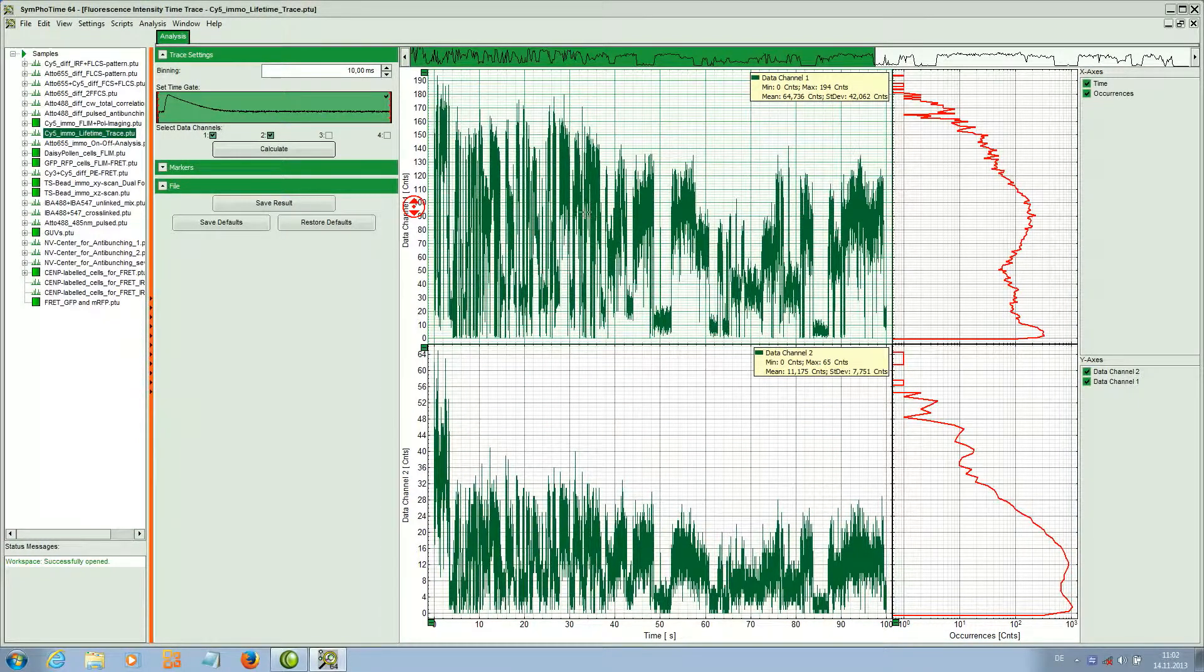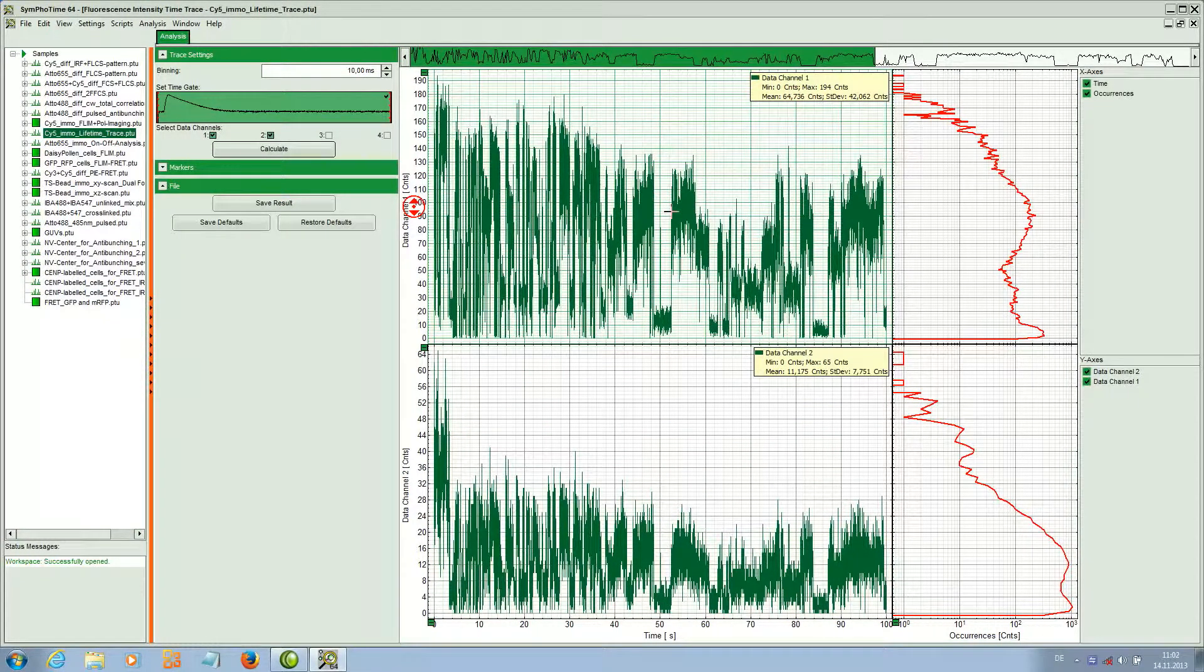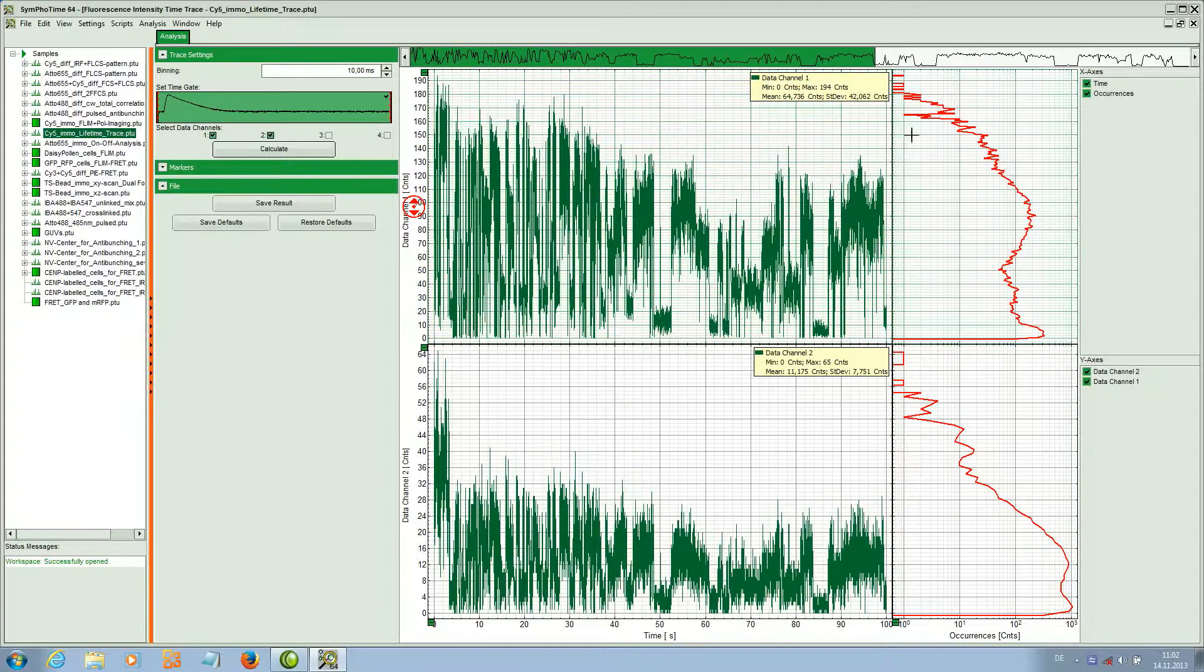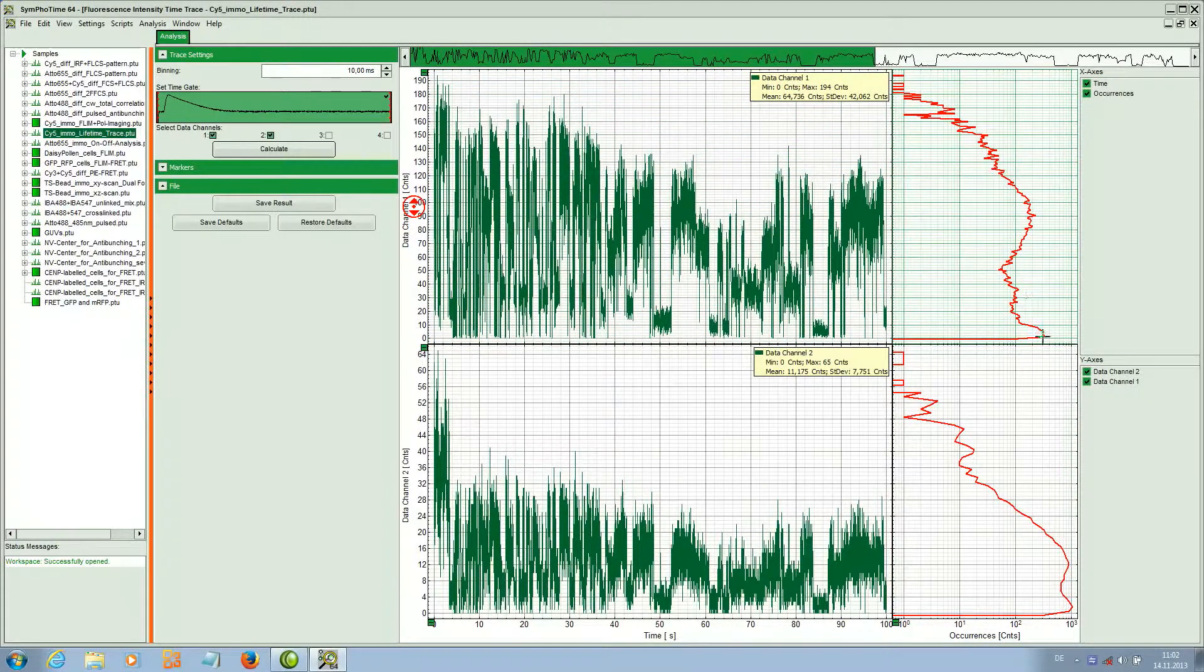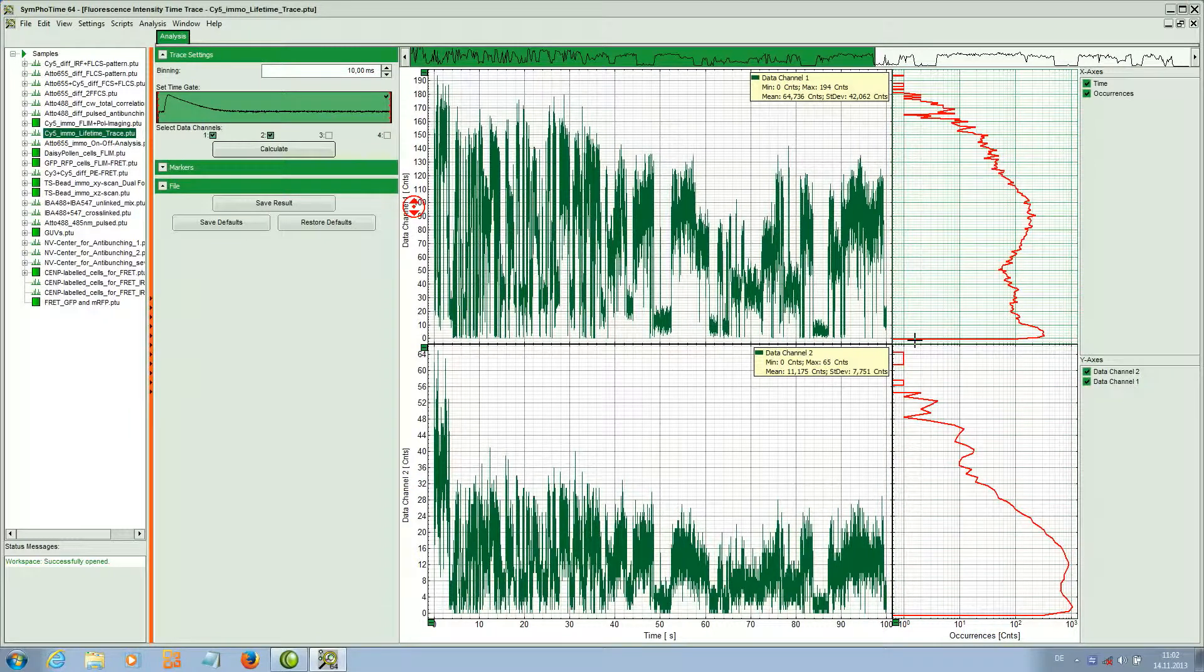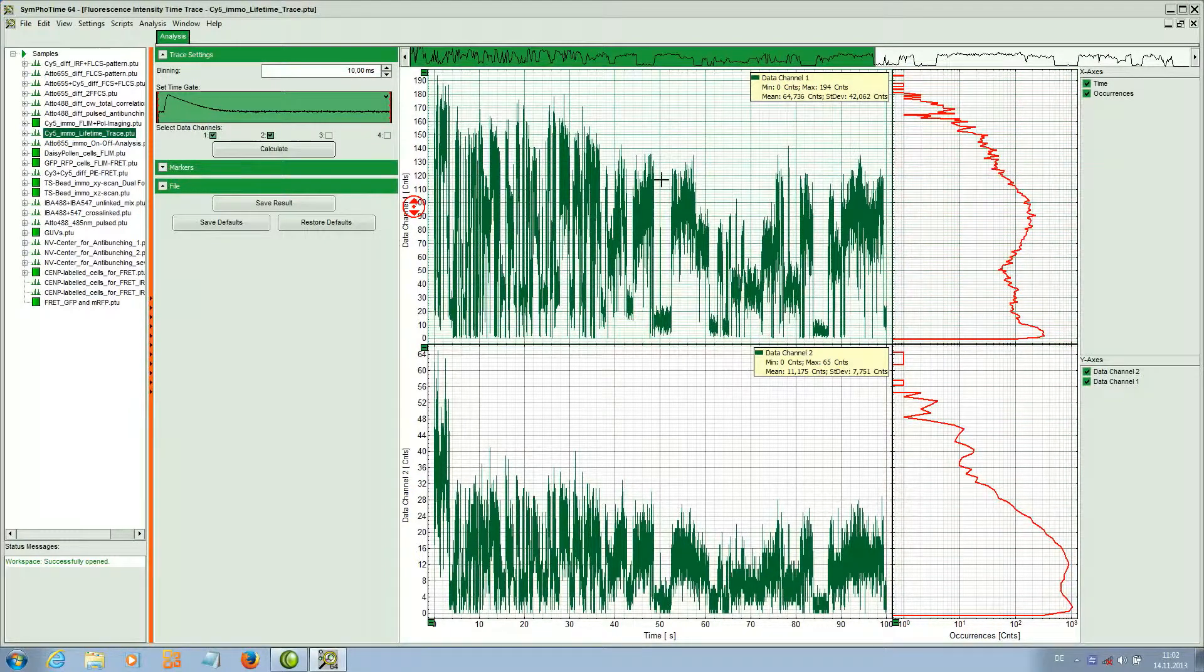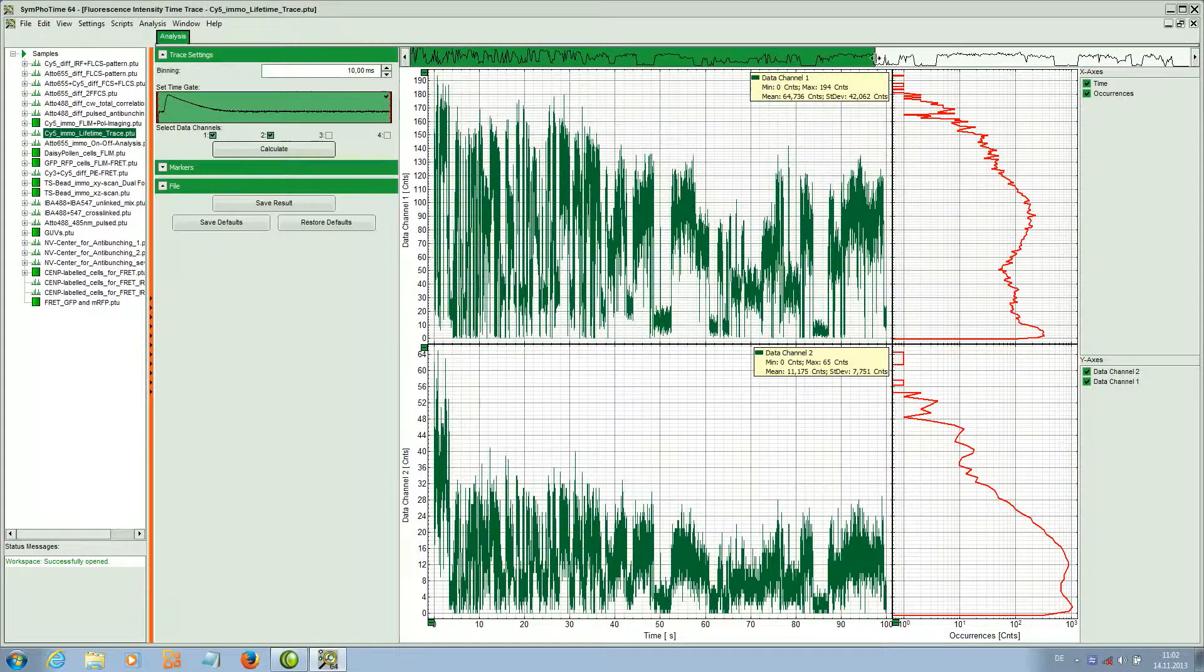Here we can see the intensity jumps. This comes from the single molecule. We see here the photon counting histogram to see the frequency of these different transitions.